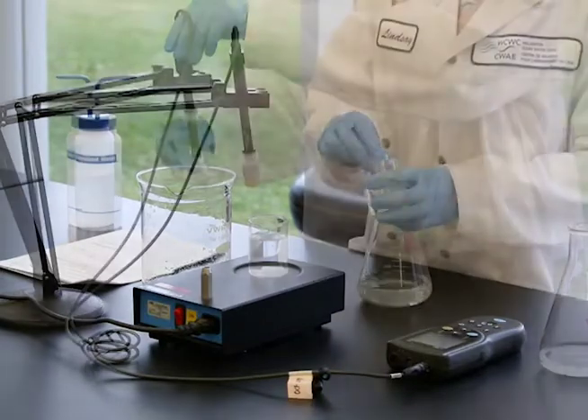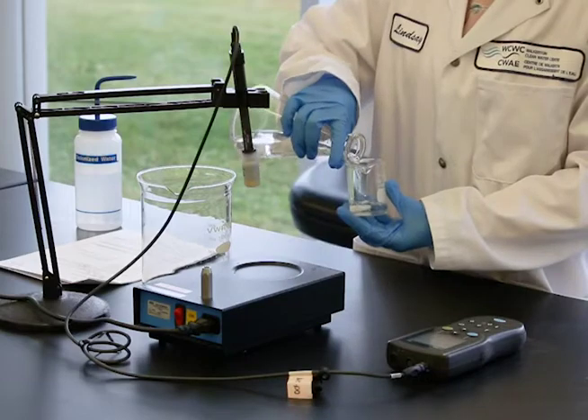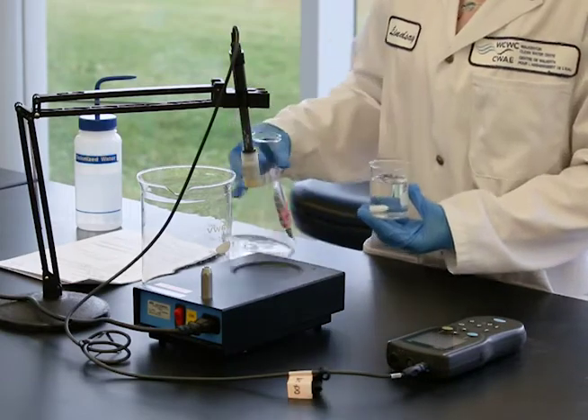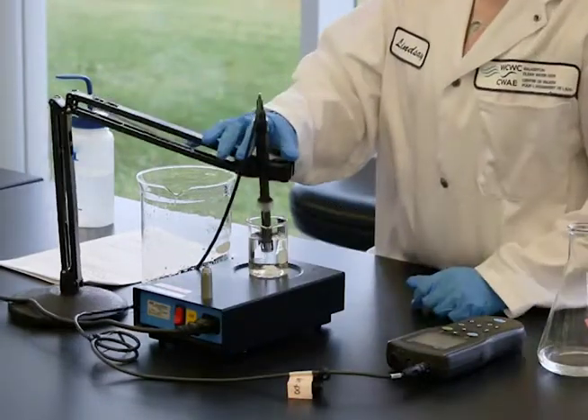Clean a beaker and fill it with your sample. Place the beaker on a stir plate and add a stir bar to it. Mount the probe so it can be submerged while not touching the stir bar, bottom, or sides of the beaker.